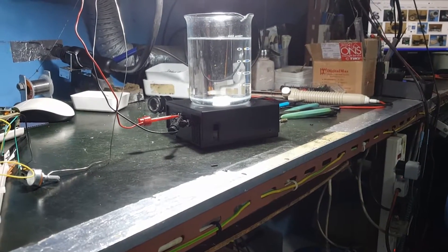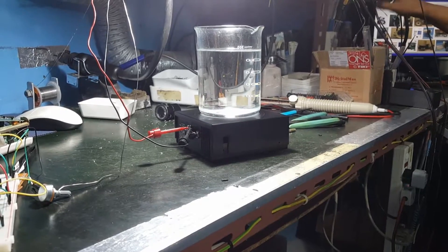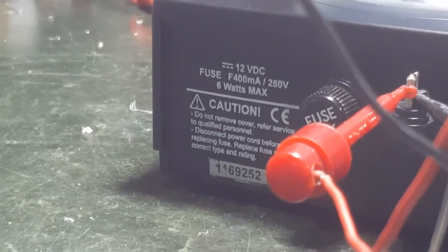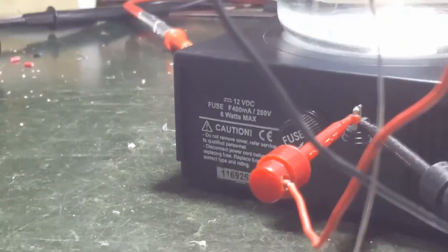We just finished repairing a magnetic stirrer. The unit actually has a label saying it is not allowed to repair, so if faulty you have to buy a new one.